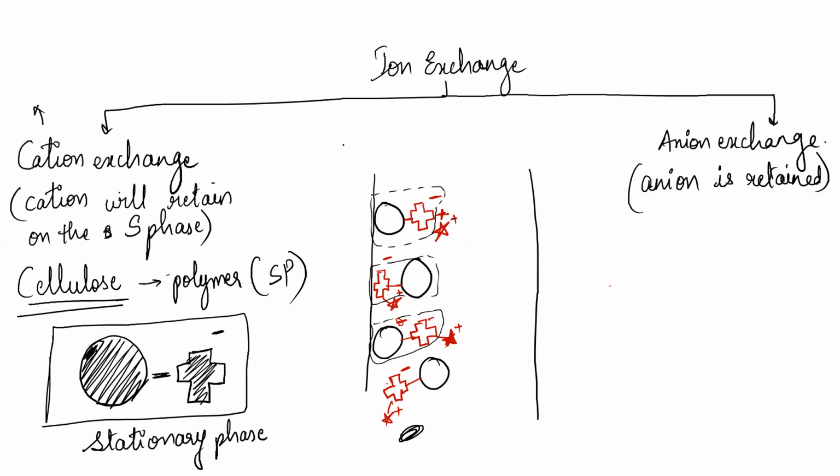Now, when you're going to add your sample and run your mobile phase, you have seen the column, first you equilibrate it, which is in the mobile phase itself. Now you load your sample. So basically your sample that you have added on the column is going to mix with the mobile phase. So let us now consider that all the analyte that you want to separate has come into the mobile phase. So the mobile phase containing the protein is now mixed.